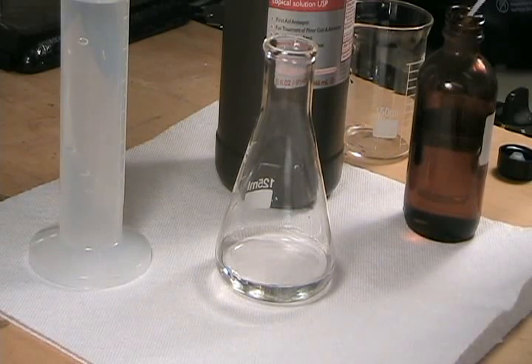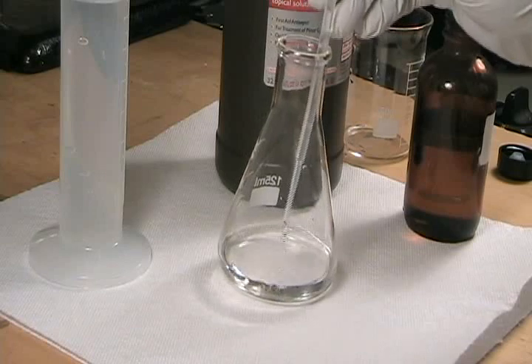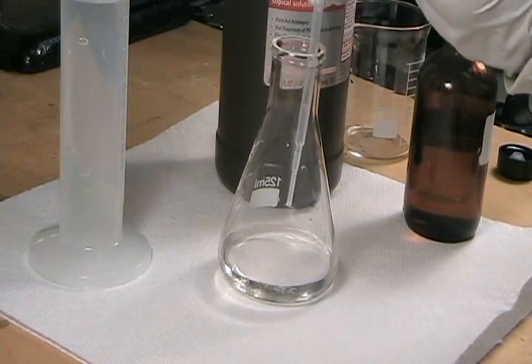With the sodium bromide dissolved, the next step is to add a strong mineral acid. I'm using hydrochloric acid, but you can also use sulfuric acid or any other strong mineral acid.